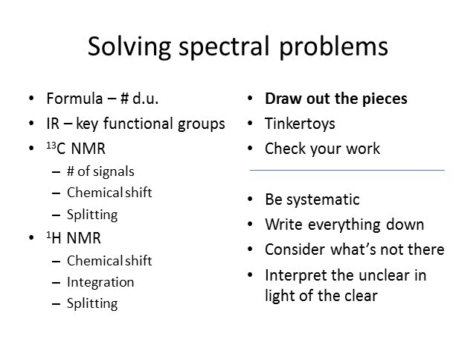There is no one right way to solve a carbon NMR spectrum, or spectral problems in general. And when I say solve a spectrum, what I really mean is start with a spectrum or a series of spectra and maybe some other information like the chemical formula or some chemical information, and then figure out what the structure is. That's what I mean by solving a problem. There's no one right way. This is my way. You can do it whatever way you want, but I think this is a systematic way that will do you well. First thing, whenever I start, I look at the formula, assuming it's provided, and for us it will be provided.